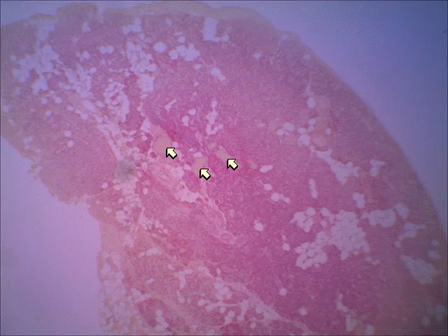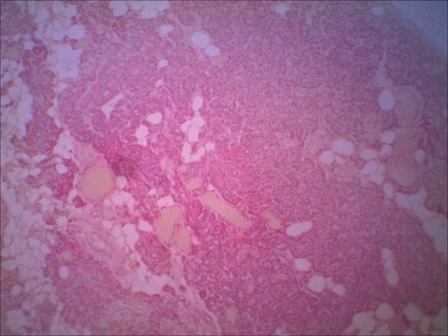So as they make these slide preparations, they have to actually remove a parathyroid from the surface of the thyroid, and many times follicles get moved too, thyroid follicles. So if you see an organ that doesn't look completely like a thyroid gland, in that it has nothing but follicles, if you see an organ that has just a few follicles attached to it, that's probably the parathyroid gland. Here it is on a higher power.